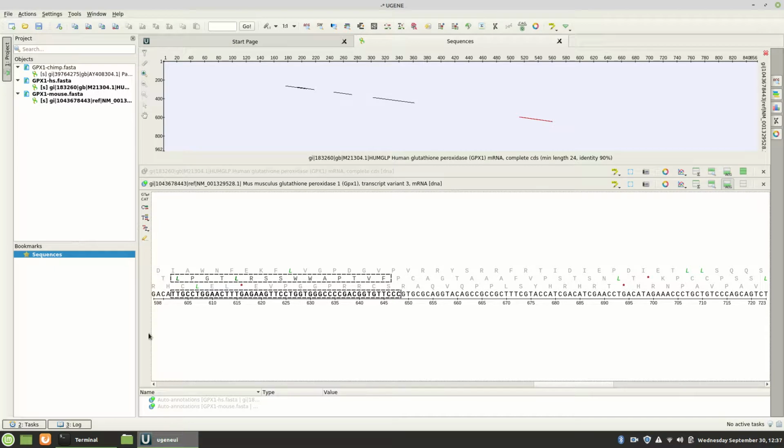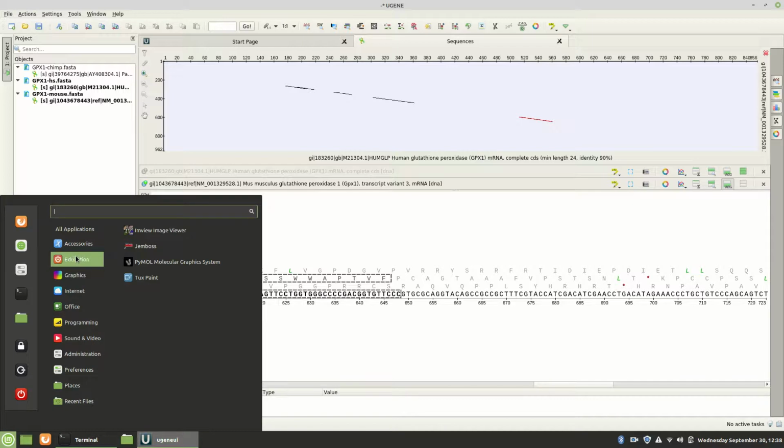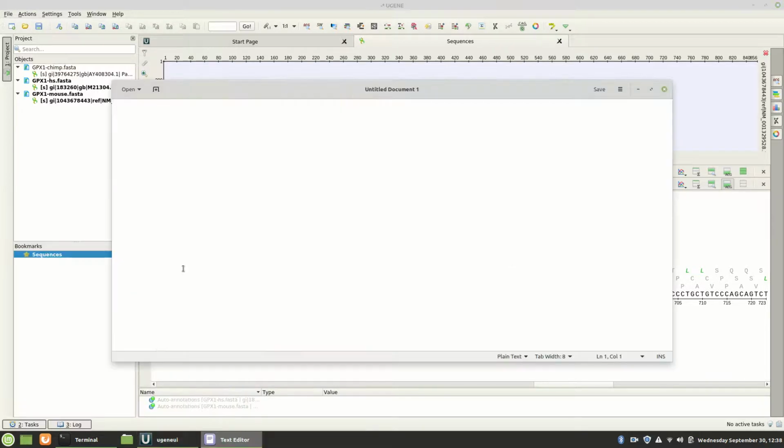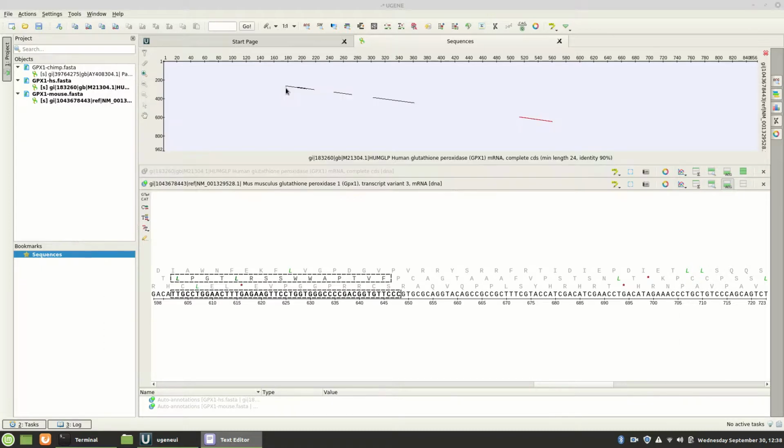Alright, and you would put that into a FASTA. So you would go over here to Notepad. I have a text editor here, the equivalent, and I can paste that in. And here would be a very small sequence that I can put in there. So that would be conserved between Homo sapiens and mouse, and maybe I would find the location here. I'm just going to count these as 1, 2, 3, 4.